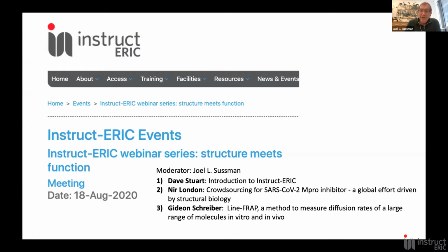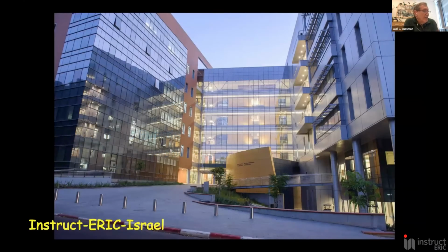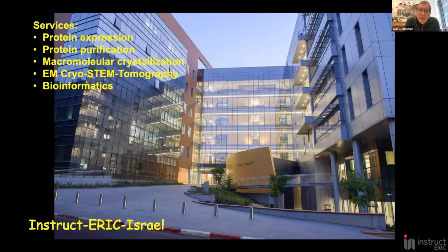But first, let me just give two short slides. One slide shows the Instruct-ERIC Center here in Israel. We are hosting this first meeting of these webinars. In our center, we have services that we give through the community, through Instruct, which you'll learn a bit more about from Dave, for protein expression, protein purification, macromolecular crystallization, and EM cryo-tomography, as well as bioinformatics.